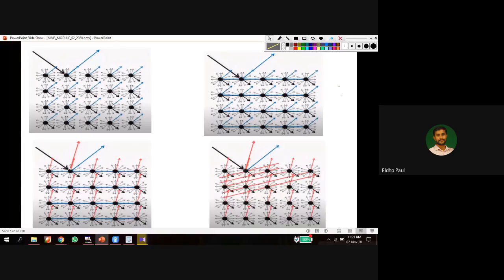And here we can see this diffraction. Here a black color incident beam and a blue color diffracted beam. This one is the diffracted beam. The incident beam is striking the particle, and it is diffracted away from the particle. Okay, that's the basic concept.